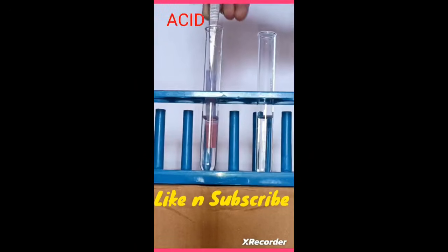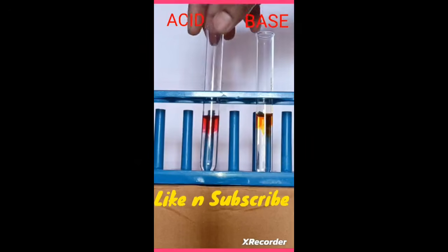Let's identify the acid and base with the help of methyl orange indicator. Blue litmus turns into red means it is an acid, and red litmus turns into blue means it is a base. Let's add a few drops of methyl orange indicator to both the solutions. Now you can see that acid gives red color with the methyl orange and base gives the yellow color.